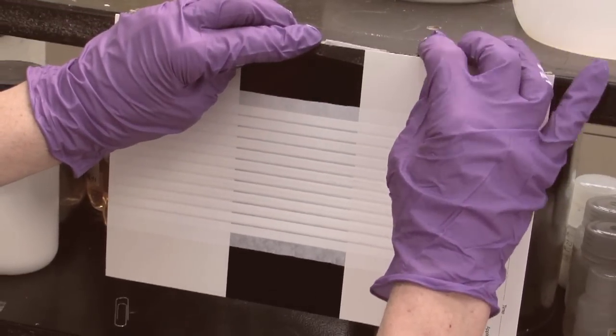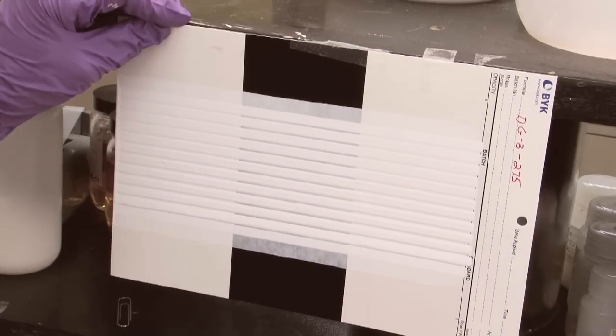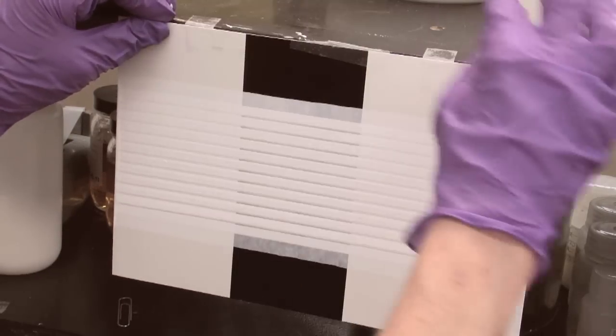Gravity pulls at the paint, causing it to sag. Results can usually be seen in one to two hours depending on the paint.